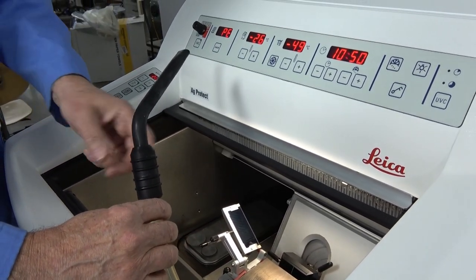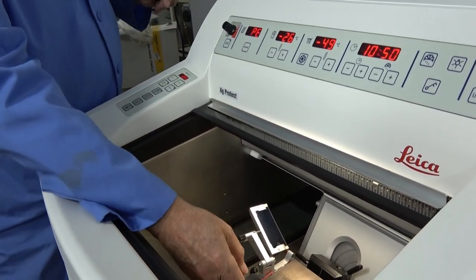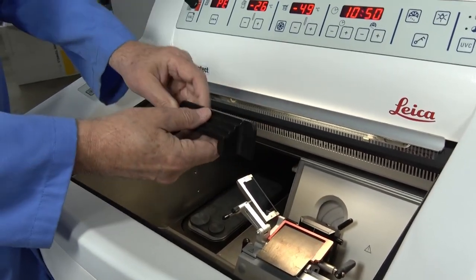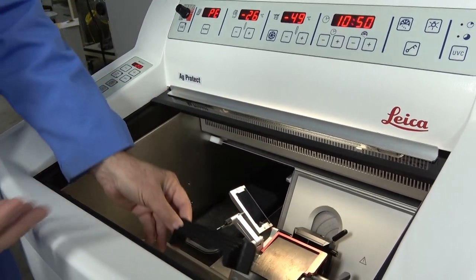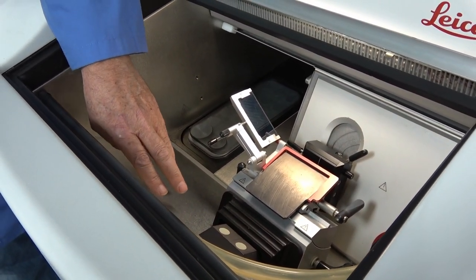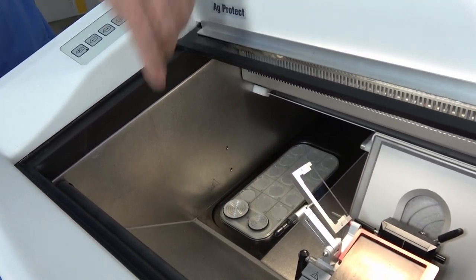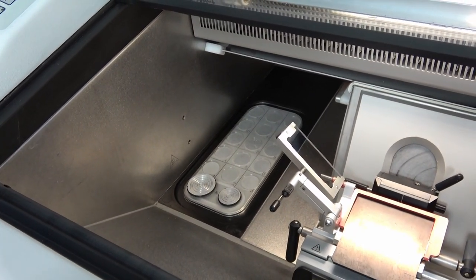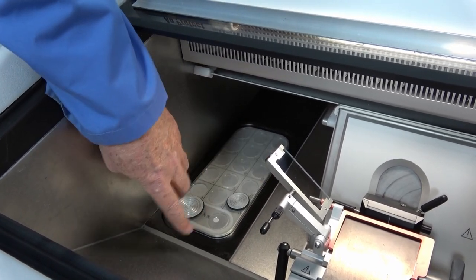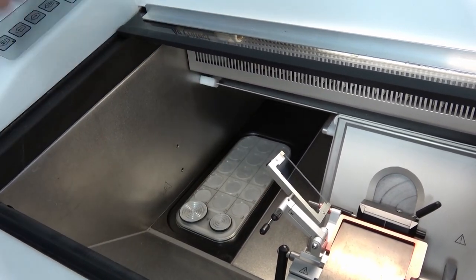This is the cleanup attachment for when you want to clean up the residue that's left on there. When buying from us or anyone else, this one is going to come with just the one shelf — many times there is another utility shelf inside. The unit does come with two sample heads and a divider for your samples so that you can have those chilling, and it can be filled up with more heads if you elect to get those.